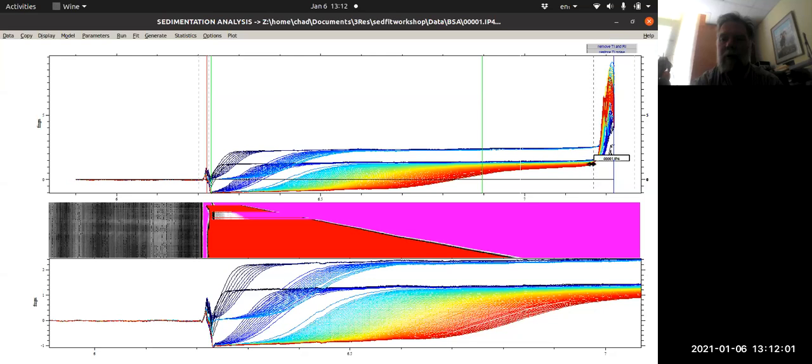And so that's probably all accumulating in this area where the concentration profile is reflecting back diffusion. At some point, what we're seeing now is just the regular sedimentation of the protein. None of the protein here seems to have felt this wall, is what I'm trying to say. And so it makes it easier to actually fit the data. So we're going to chop out this portion of the data. We're going to fit between these two green lines.